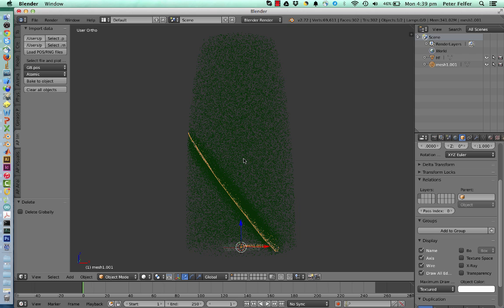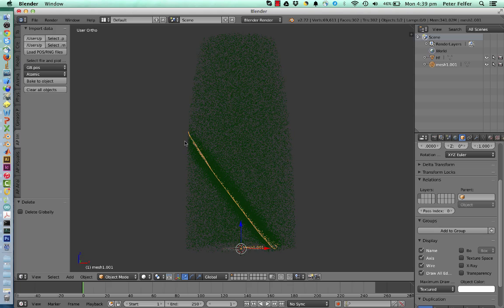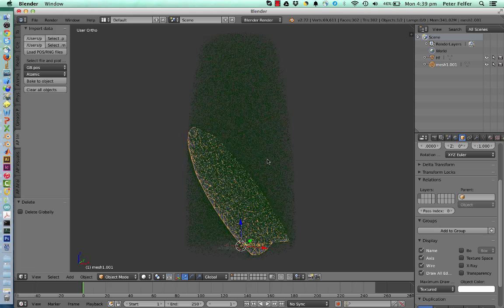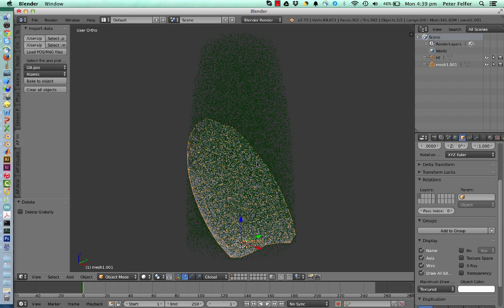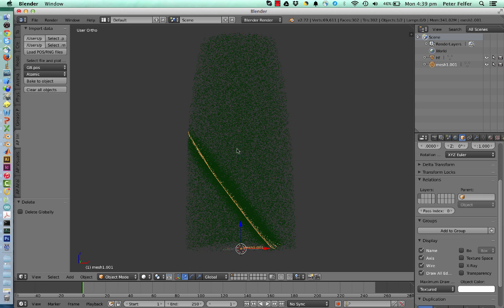I have to find it in Blender. There are also some other algorithms that you can use, like either concentration surfaces or isosurfaces, and you can calculate those in Matlab. But you can do, for example, some manual modeling in Blender, or some sort of semi-automated modeling using my algorithms, and you get one of those grain boundaries, and we'll calculate a proximity histogram from that.